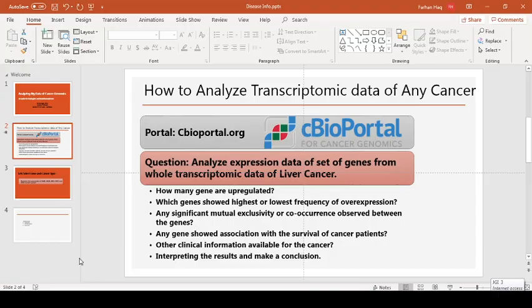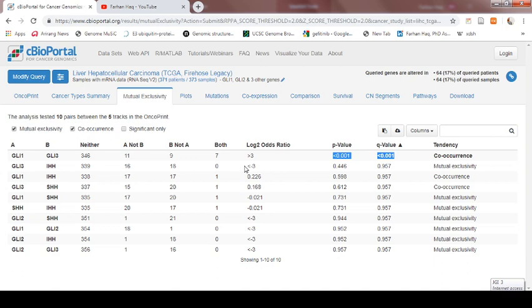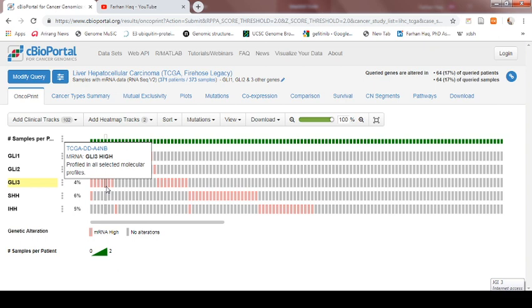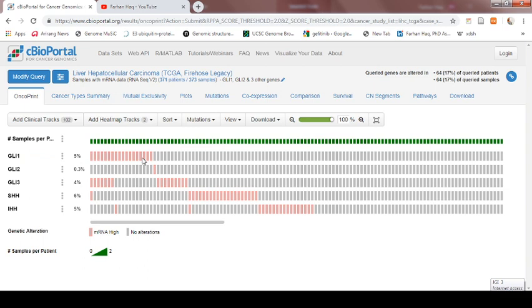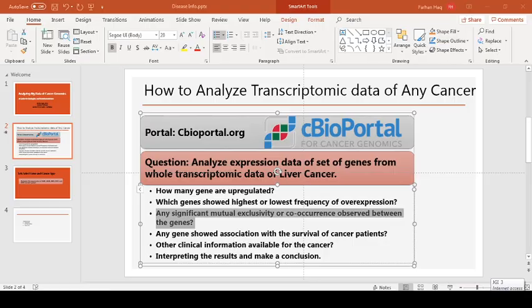Only Gli1 and Gli3 showed a significant association of co-occurrence, with a p-value less than 0.05. So only one combination showed a p-value less than 0.05. We can answer this question: only Gli1 and Gli3 showed significant co-occurrence between each other. If you want to see it graphically, most of the samples showed expression in both genes compared to the rest of the samples. There is no co-occurrence between Gli1 and Gli2, Gli1 and SHH, or Gli1 and IHH — that is why only that pair showed a significant p-value.